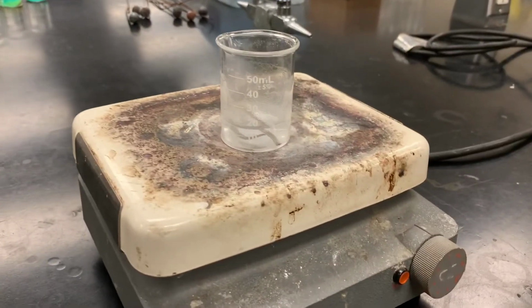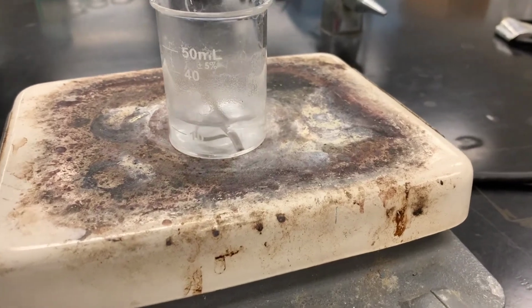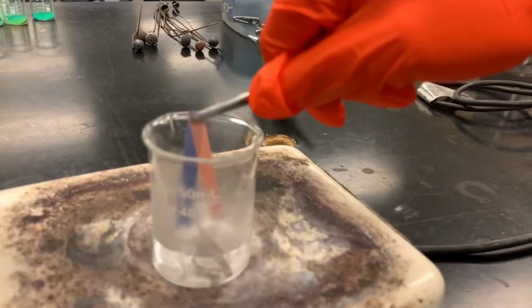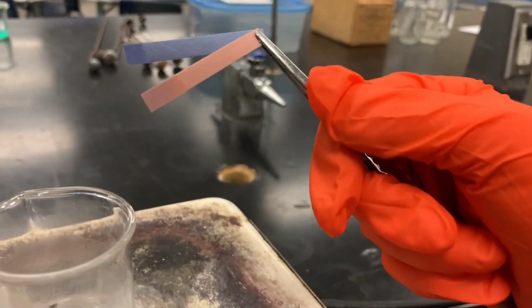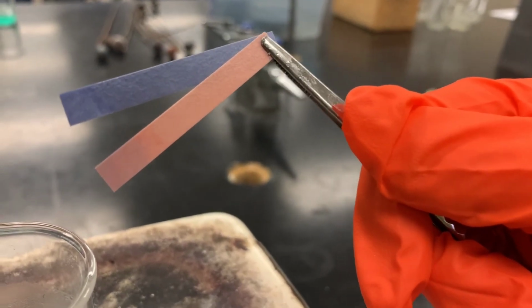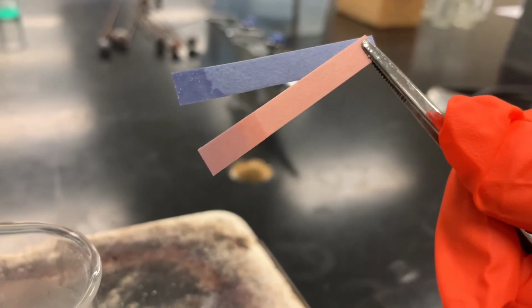So we notice that there is no reaction here. We know that if we add heat to a substance, then sometimes we can help to speed up a reaction. And I noticed by putting magnesium in hot water, there is some bubbling happening at the surface of the magnesium there. So we do get some evidence of gas being created. Okay, let's test that with litmus paper. There's a slight tint of blue coming, not a lot, but there is a bit of evidence, a little bit of blue on that red litmus paper. So it looks like we are getting a bit of a reaction there.